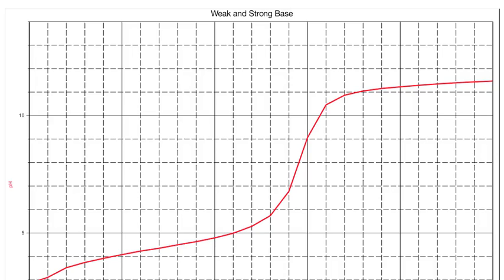This is a review of the lab of a weak acid strong base titration. In this lecture, I'll be showing you how to identify all the necessary components of this informal lab. And I want to stress for those that are listening that this is a non-equilibrium type lecture. So we will stay away from equilibrium type problems until later in the course. This is just basically a stoichiometry version of the titration.